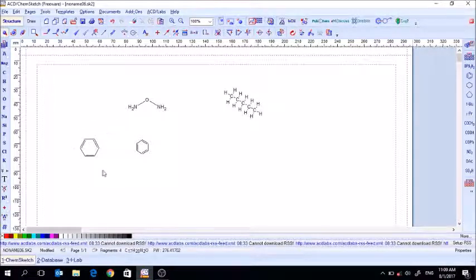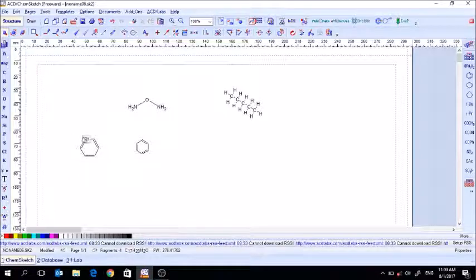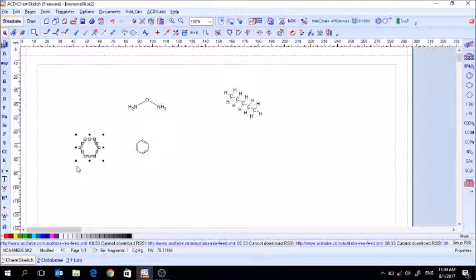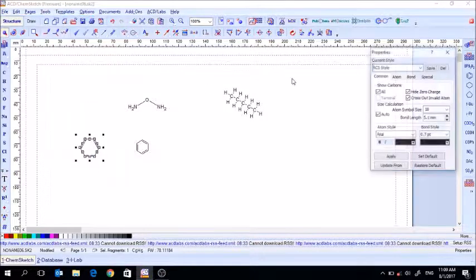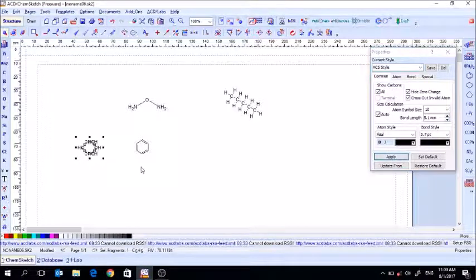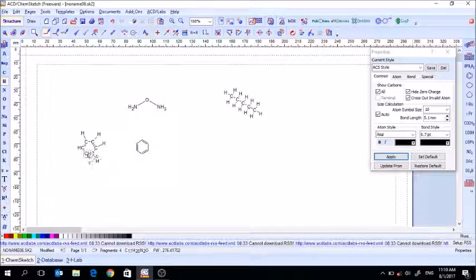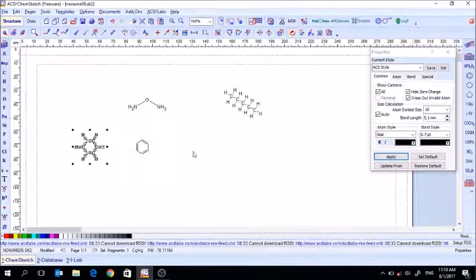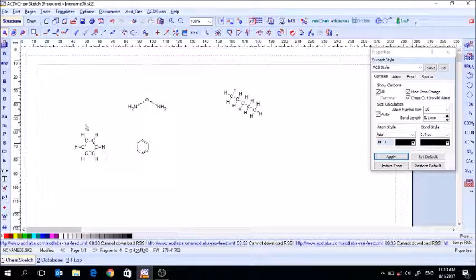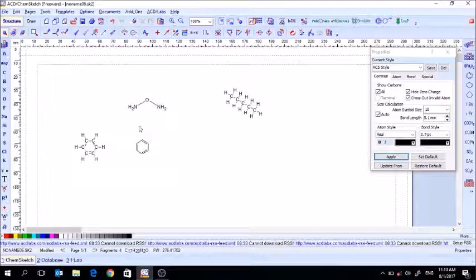You can see the cleaned benzene ring is much simpler to look at. If you select it, go to Tools > Structure Properties, and show all carbons, it looks very cluttered and it's hard to tell what's going on. You can pull the hydrogens out to see more, then clean it up so it's symmetrical. For very large structures, sometimes it's easier just to view it in line form.